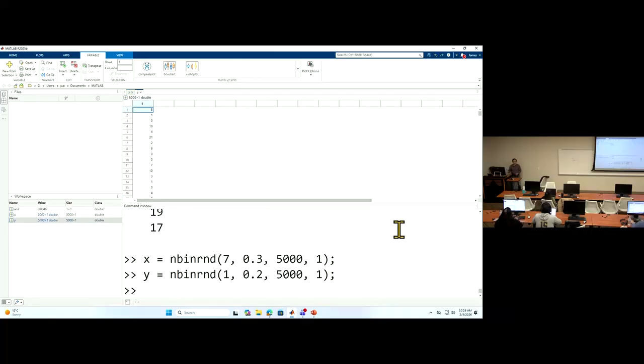The Y, it's really small. I don't know how to make this font bigger. But the second gene, I also simulate 5,000 cells for that particular gene's expression. Then you see 8, 1, 0, and you start to see 0 because this Y is small. So this looks more realistic if you compare the real data.